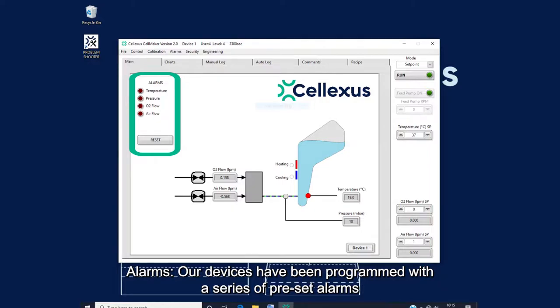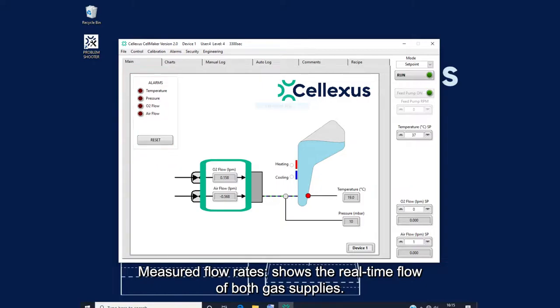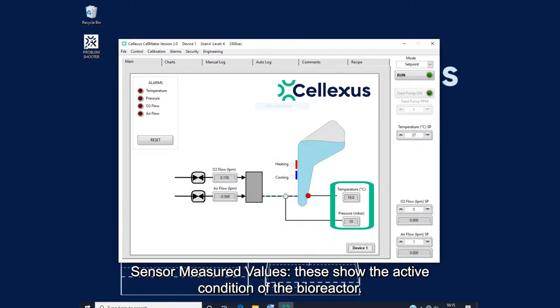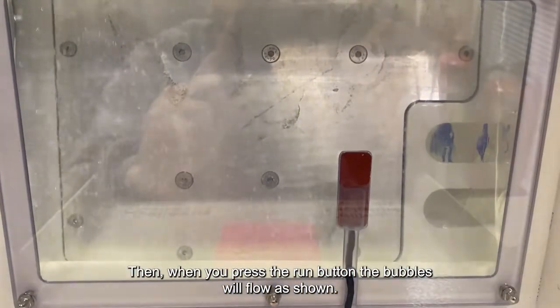Alarms. Our devices have been programmed with a series of preset alarms on the sensors fitted for the system for temperature, pressure, O2 flow and air flow. Measured flow rates, which show the real-time flow of both gas supplies. Heating cooling indicator shows how the Peltier units are working at that moment. Sensor measured values. These show the active condition of the bioreactor, and when the run button is pressed, the bubbles will flow as shown.